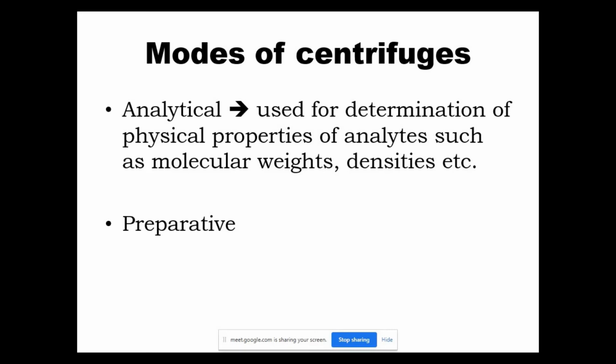So here, what happens? This is a special type of scientific machine which is not there in our department, or in our college also. I think it must be there in the IIT and all. When you do the centrifugation, these molecules' velocity is measured by a detector. That means these tubes have some kind of camera or detection system that measures at what velocity the particles are moving. It can calculate the velocity. That is for analytical centrifuge, which commonly we do not do.